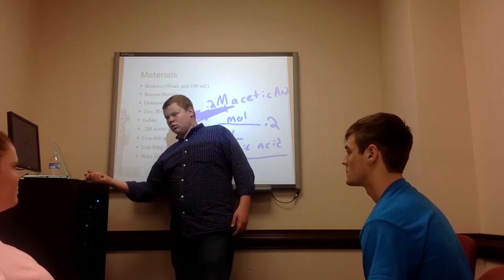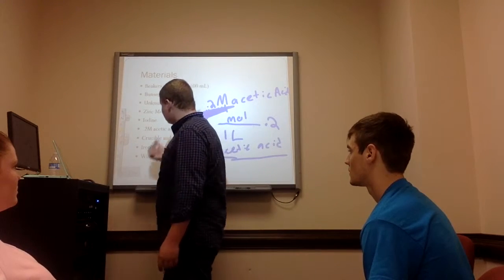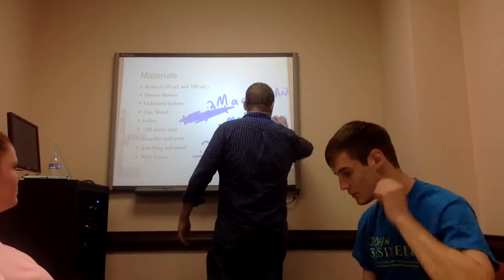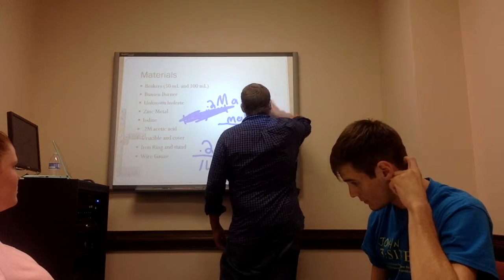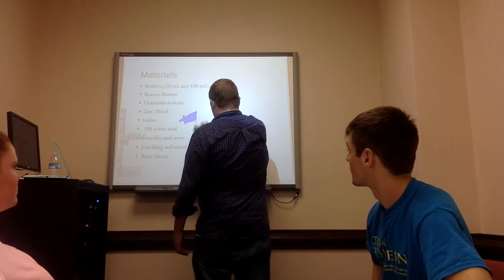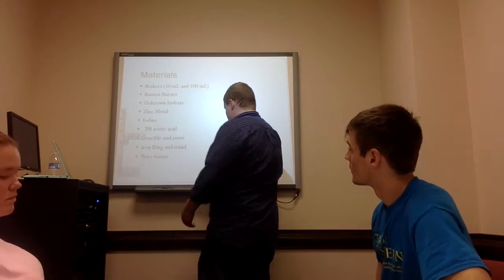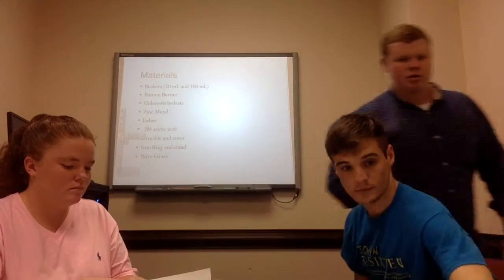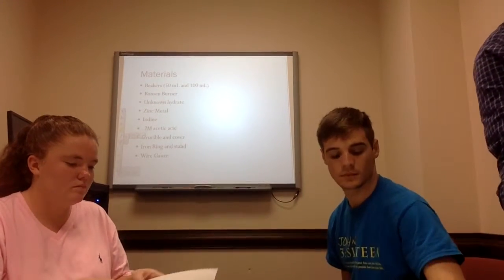So, we're going to go ahead and get started today with you all explaining what you did in your lab. We're going to start with the procedure. I've got my lab manual. Thank you, Mr. Crossley.